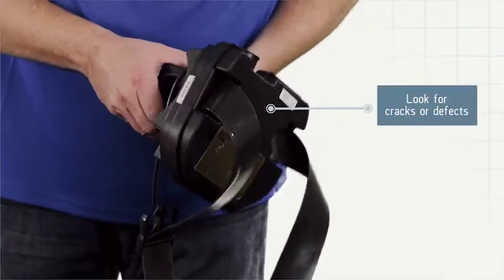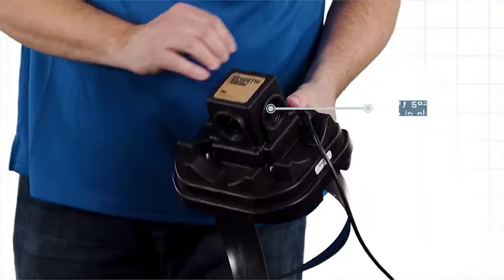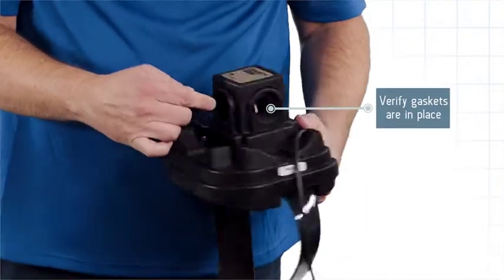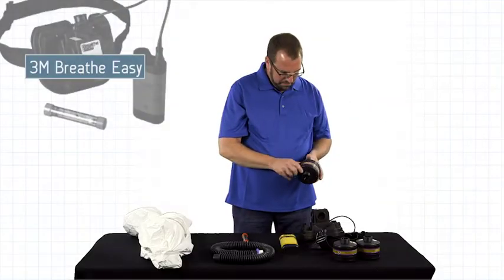Verify the service sticker. Inspect the blower housing unit for cracks or physical defects. Verify that all three gaskets are in place. Inspect and install the cartridges.